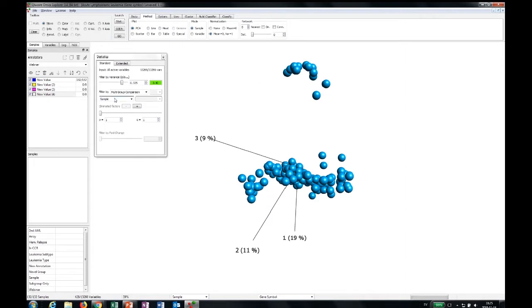And then to collect the information that this is a separate group, the way to do that is to select color, not necessary, but it will make it easier. Then select a group without members, select the annotation tool, and just circle those samples. So now we have divided the data set in two groups. 118 samples or patients are in the blue group, and 14 samples are in the yellow group.